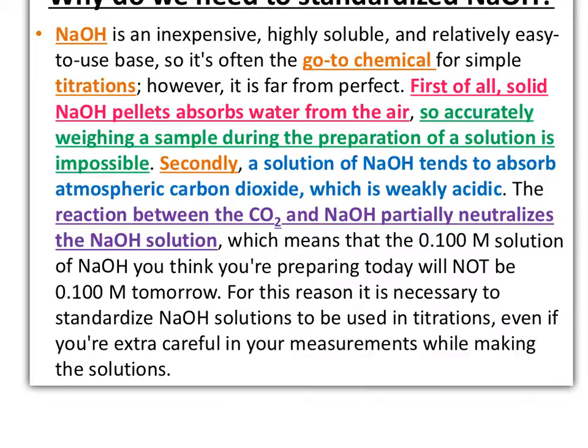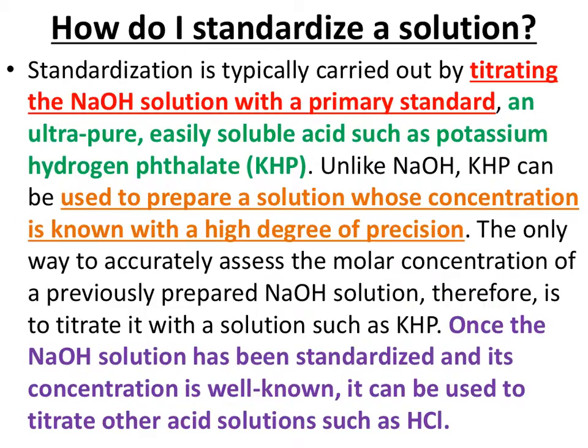So, going back, the first thing you've got to do: rinse the burette and tip 3 times. Second thing, standardize your solution. How to standardize? I don't think I want to waste time.